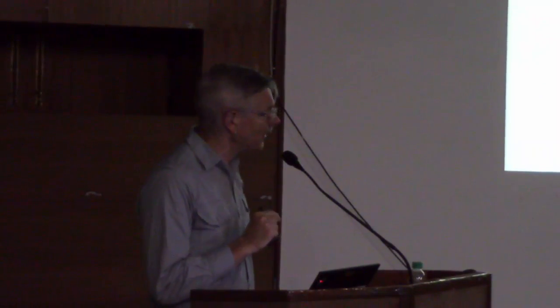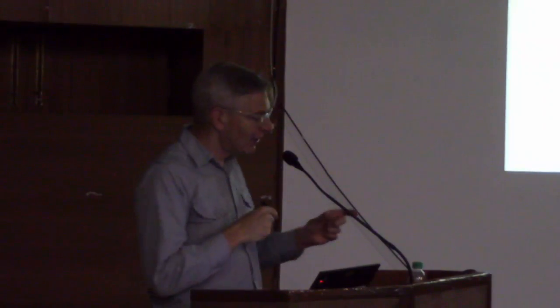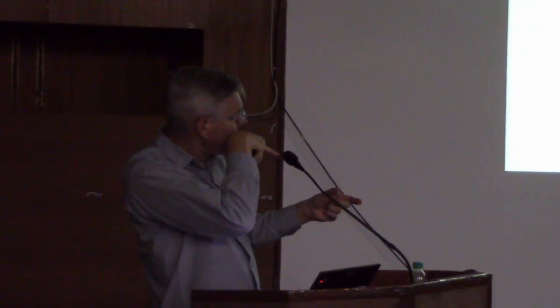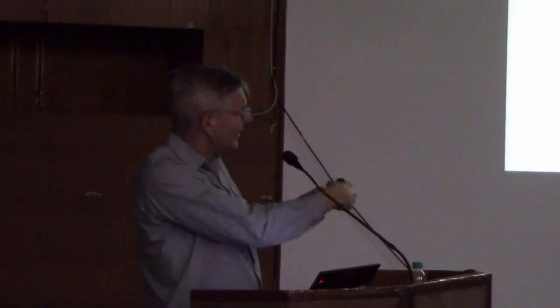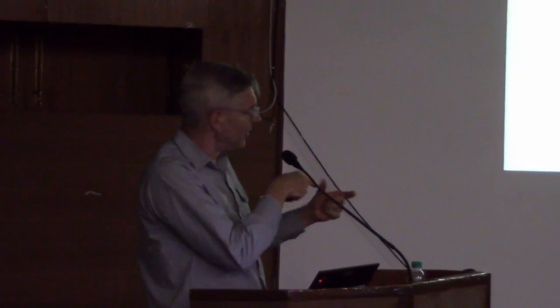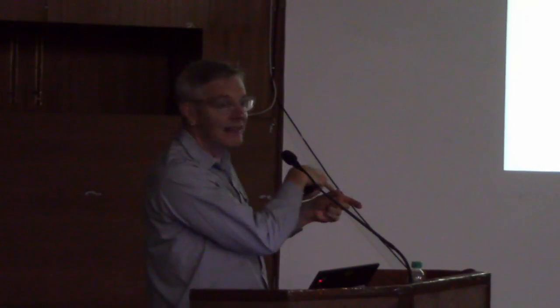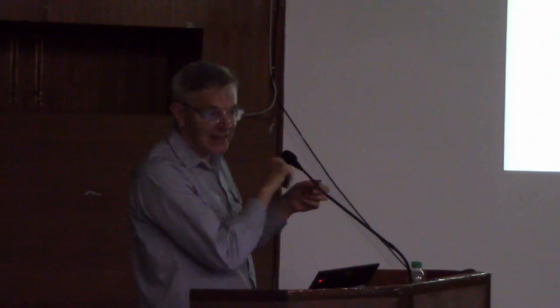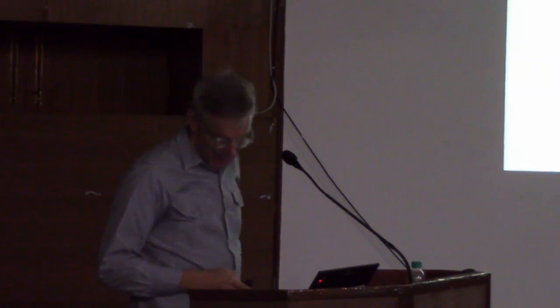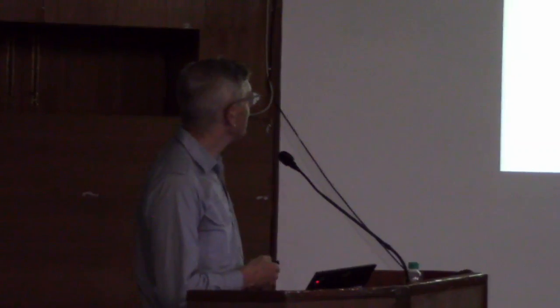But the ones that are giving the highest intensity are these micro focus. And they have a long line, and then what you do is you look at grazing incidence at the line. So you're getting X-rays from that whole long line, but you don't look at it this way on and get a broad beam. You look at it this way on, so it gets focused into a very small spot. So there's very high intensities coming from these micro focus sources.